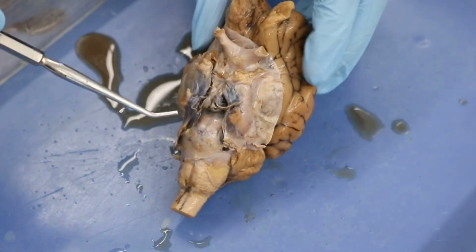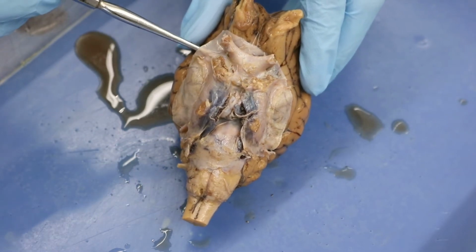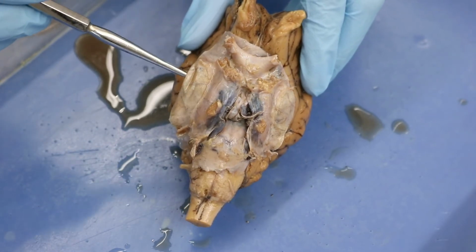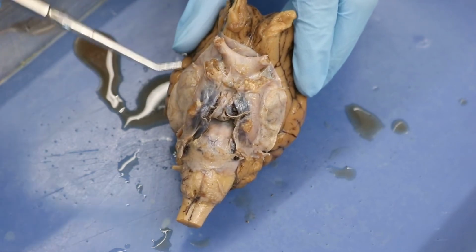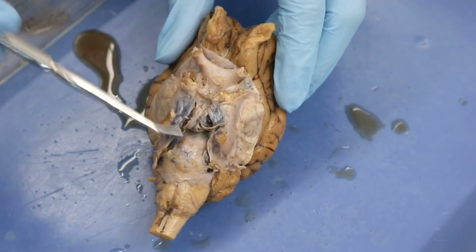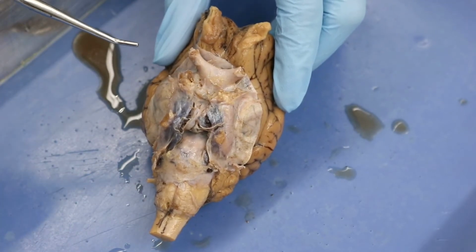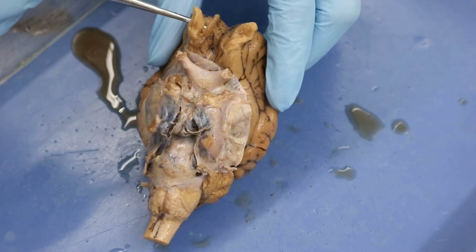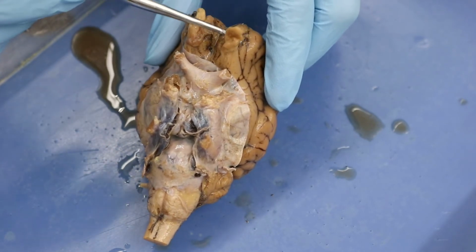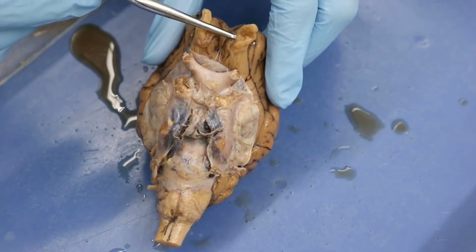Now, as we said, we still have our dura mater attached here. The main reason for that is because if we pull this off, we would lose a lot of these cranial nerves. So we want to make sure we see the cranial nerves before we pull off the dura mater, okay? So first off, we have cranial nerve 1. Cranial nerve 1 is on both sides. Remember, that gives you a smell sense. It's called the olfactory nerve.